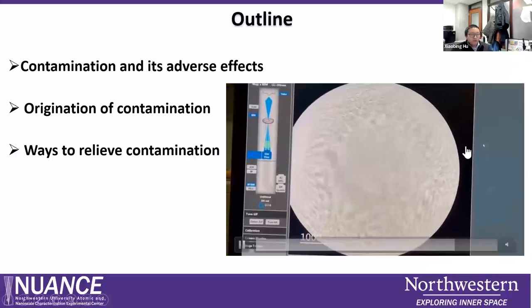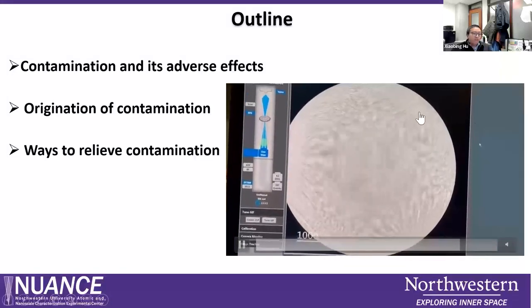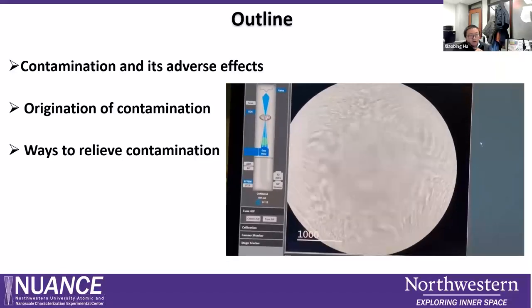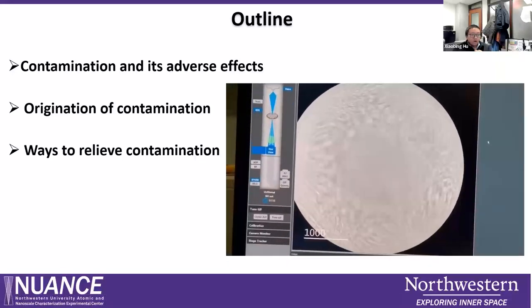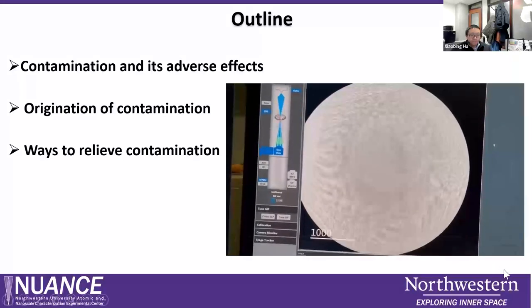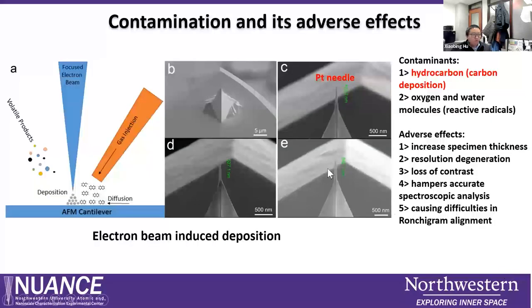If a result like this happens, it at least means the holder, the column, and your sample are all clean. Anyway, let's move on. So what is contamination?